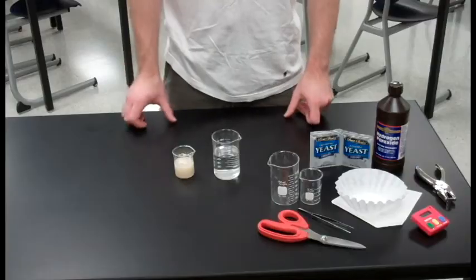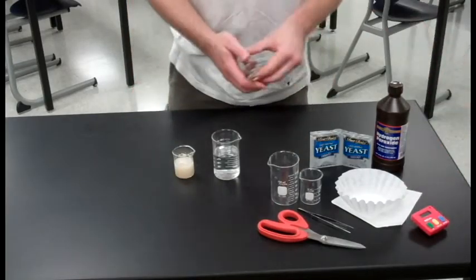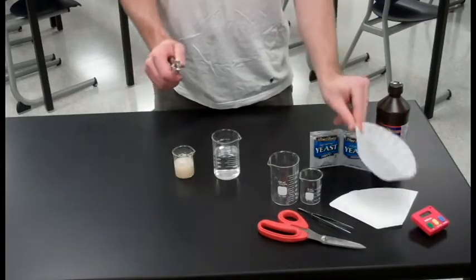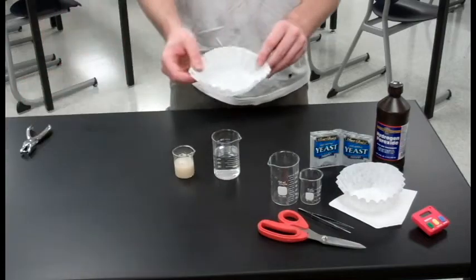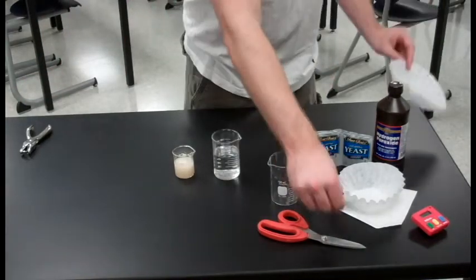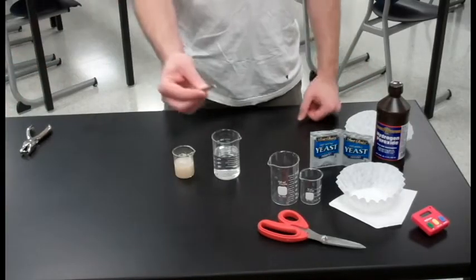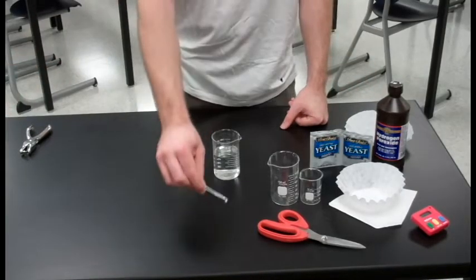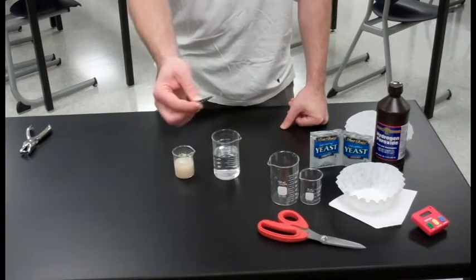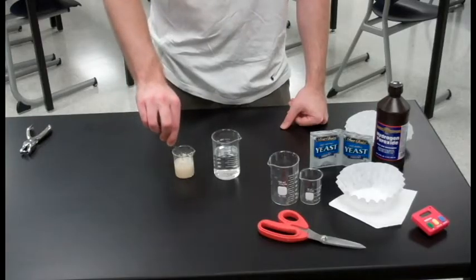Now we've got a suspension of our yeast. The next thing we need to do is take our hole punch and some filter paper and punch some holes into it. Once we've punched our holes, the disc itself is what we're interested in. Take some forceps and take the disc that comes from punching a hole and get it good and saturated with yeast.